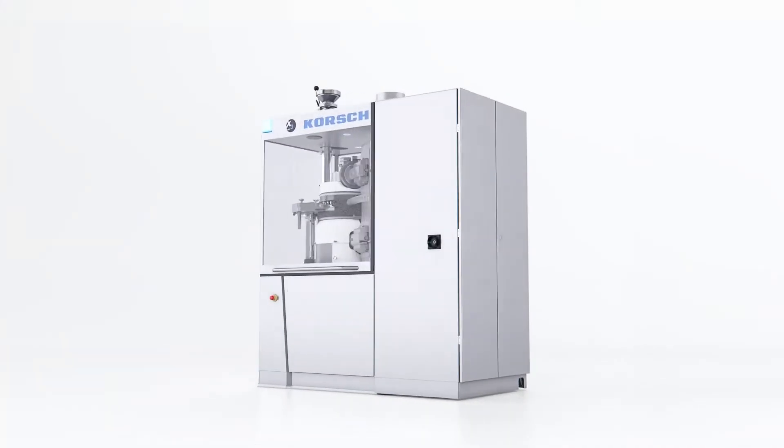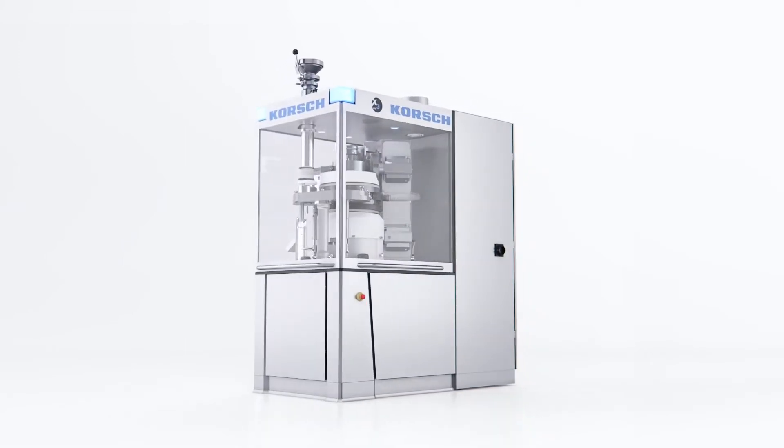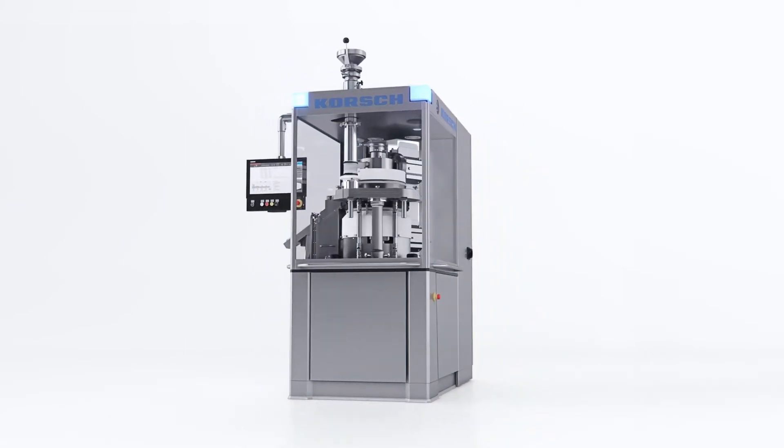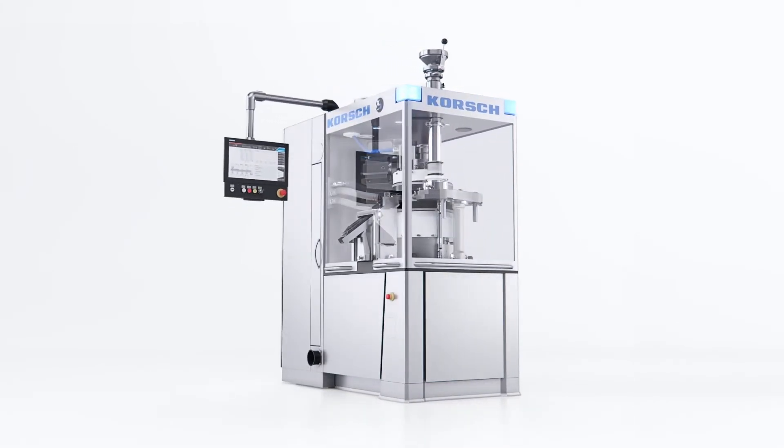Among other innovations atypical for its size, the X3 features an integrated electrical cabinet, a torque drive, a fully sealed design, and unsurpassed accessibility for operation and maintenance.